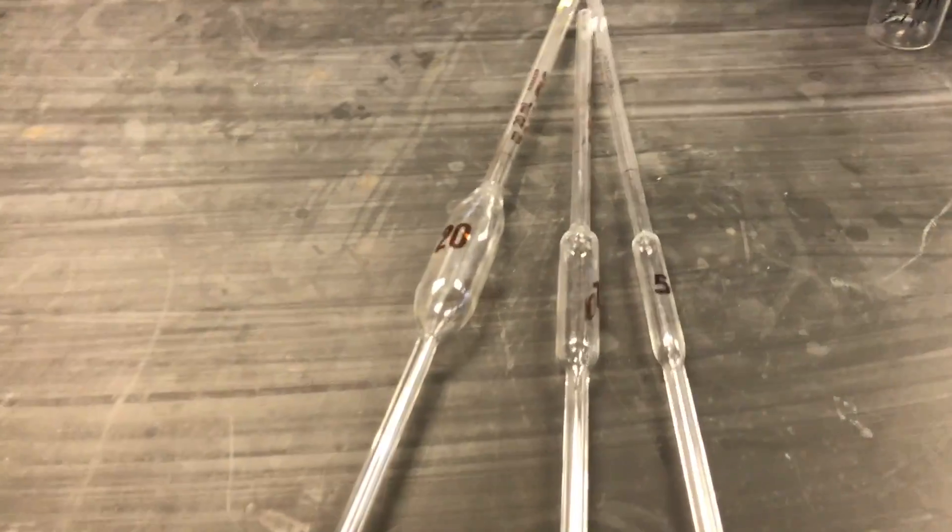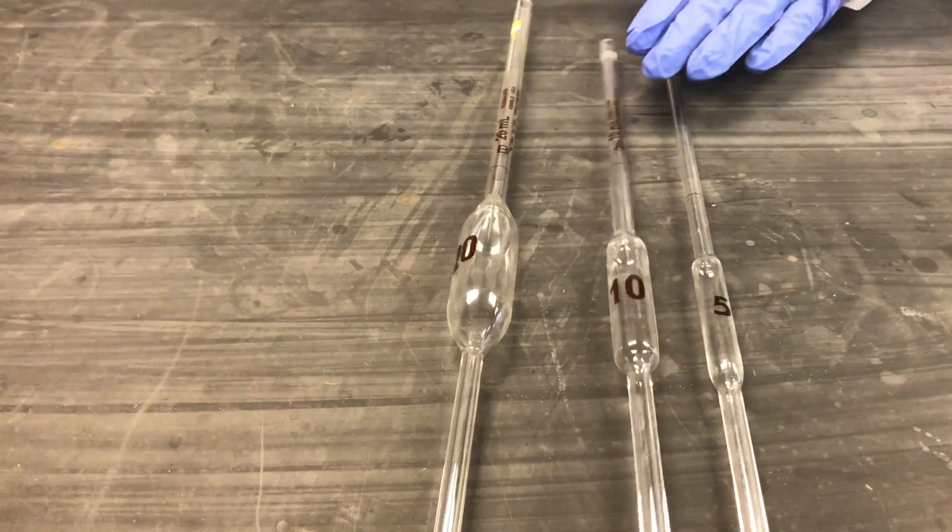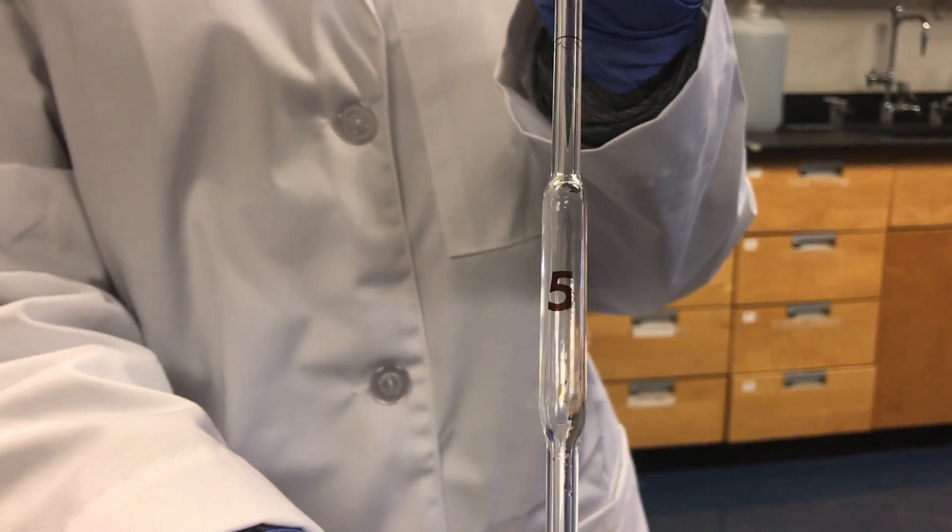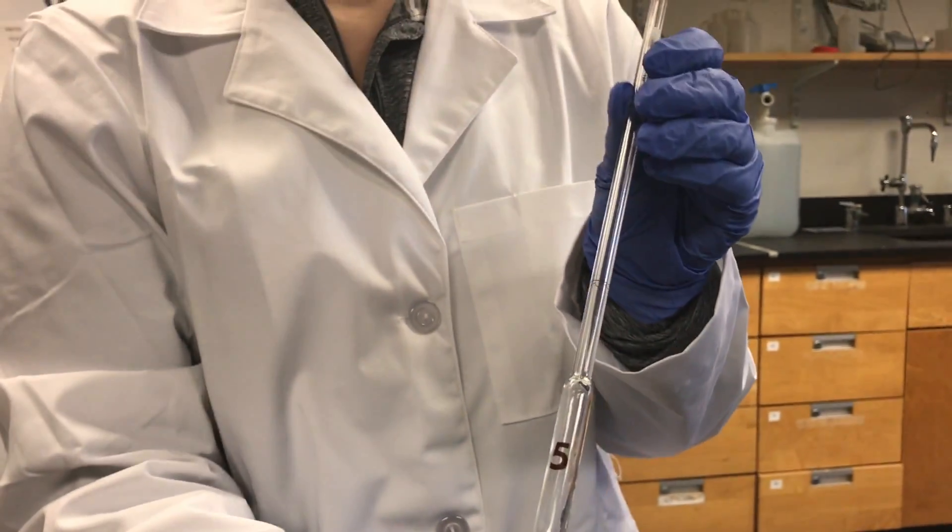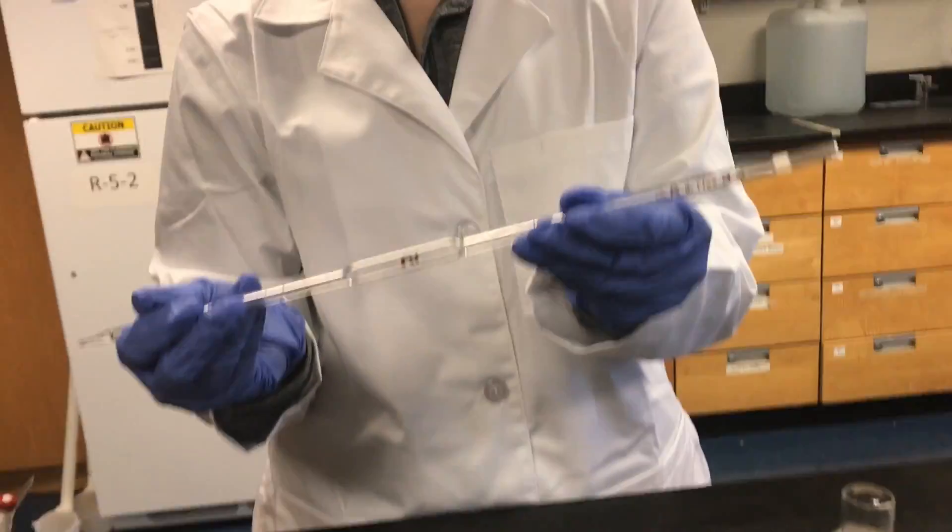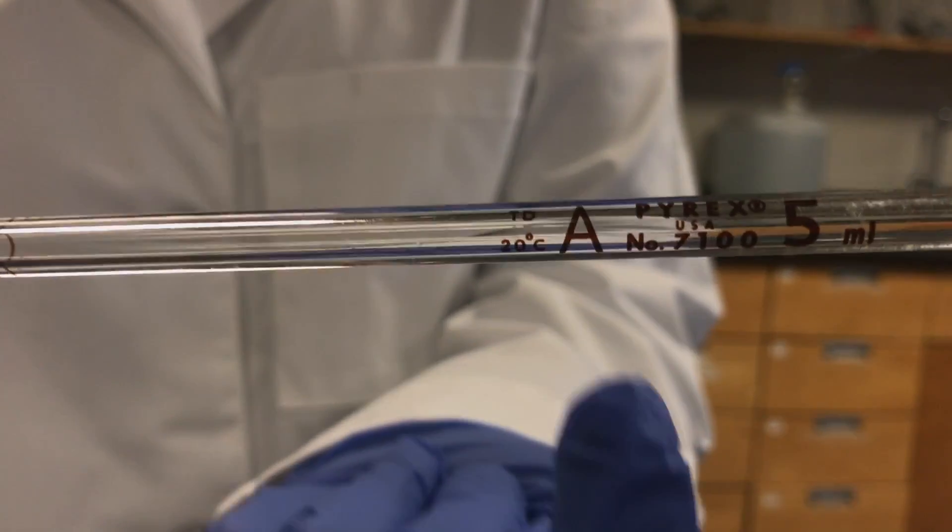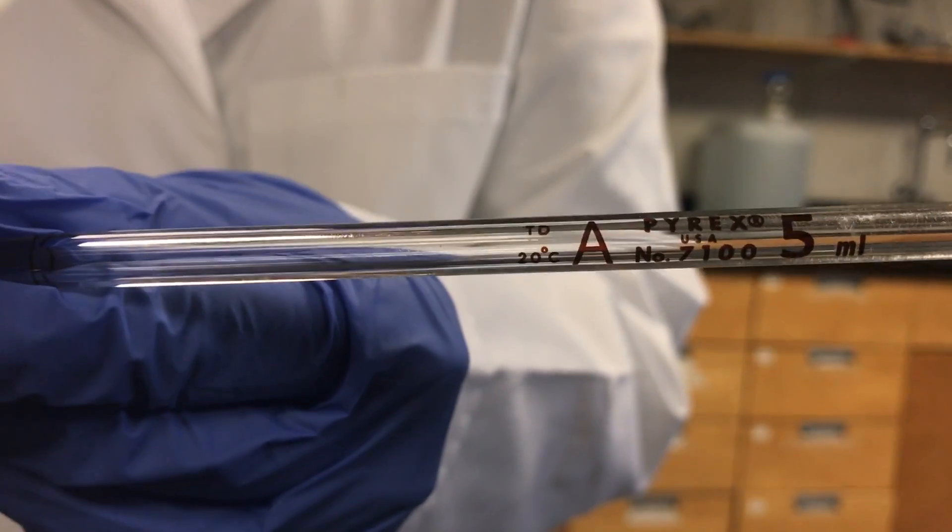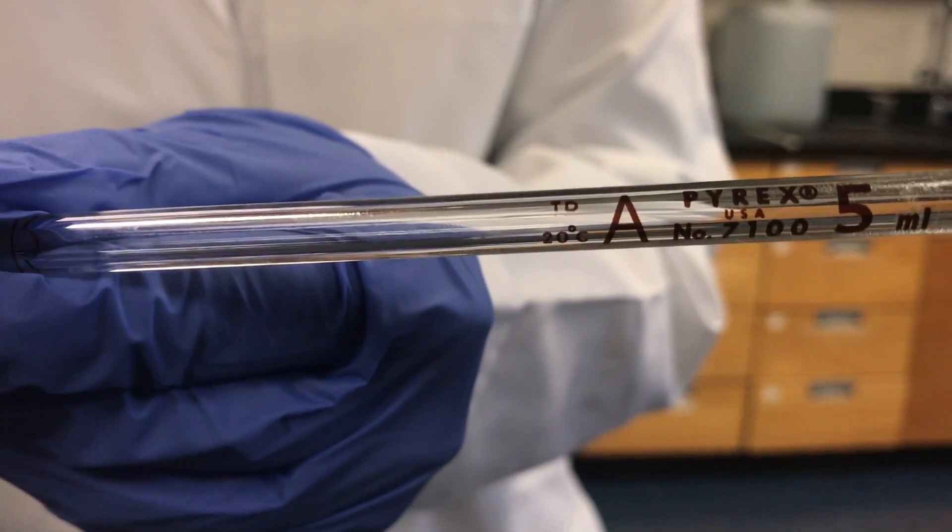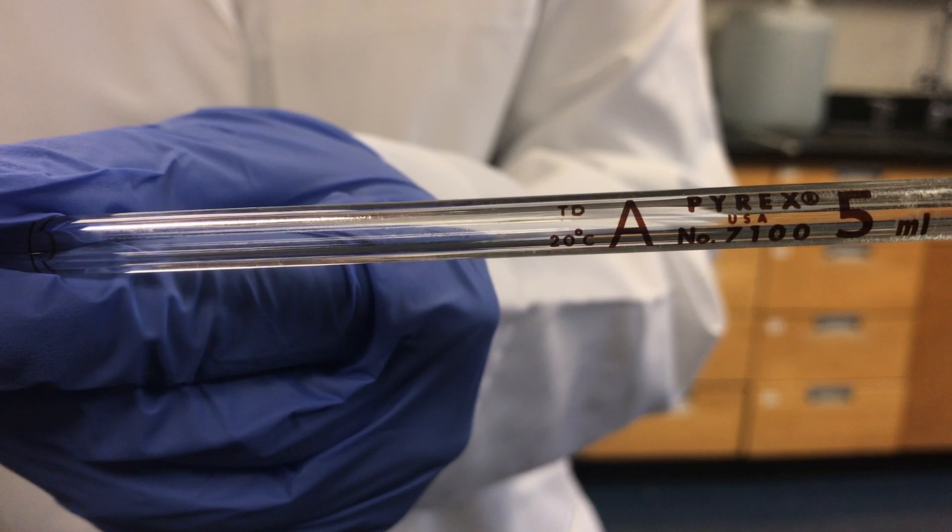Here are some examples of the different volumetric pipettes. Here is a 5 milliliter pipette. It's important to note the information on the top of the pipette. The letter at the top refers to the class of the glassware. This pipette is a class A which refers to the error associated with the glassware, but you can look up in chapter 2 of your Harris textbook.